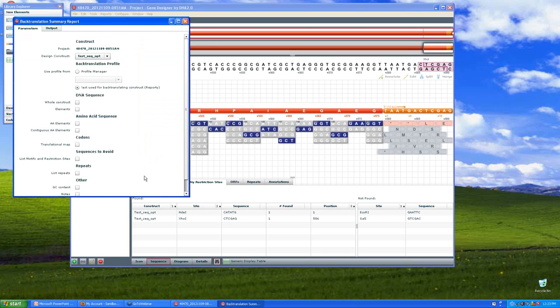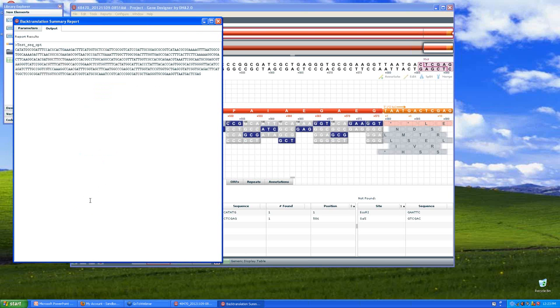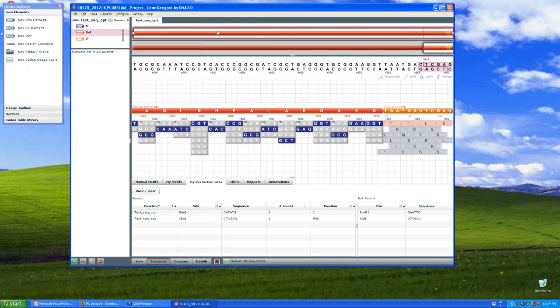And there are a lot of useful things that you can get a report on. And so you can click as many of these as you'd like. But the most important for this element would be the whole construct. And from here, you have a FASTA format of the entire construct, again, from my NDE down to my XHO. So I can copy and paste that out and save it to my favorite program.